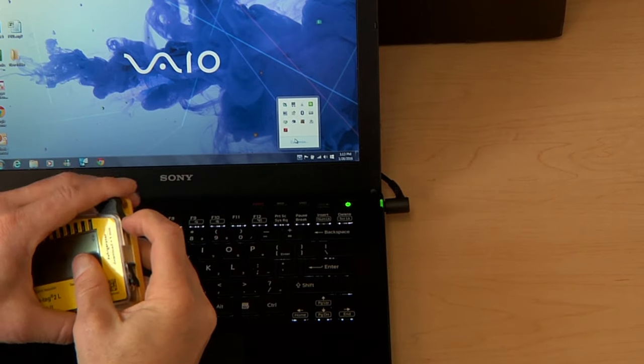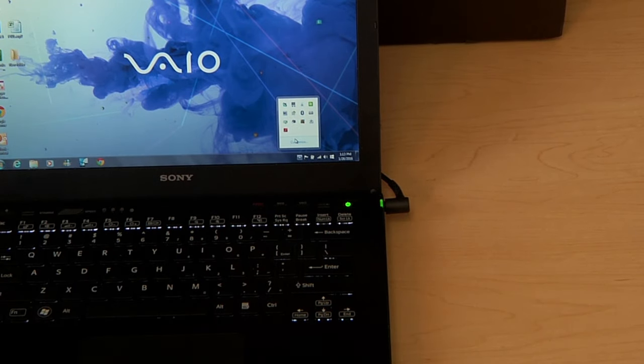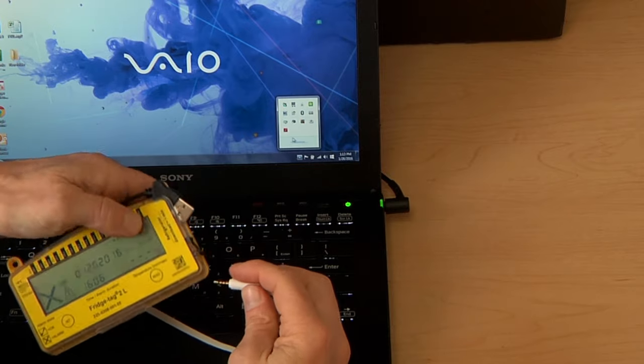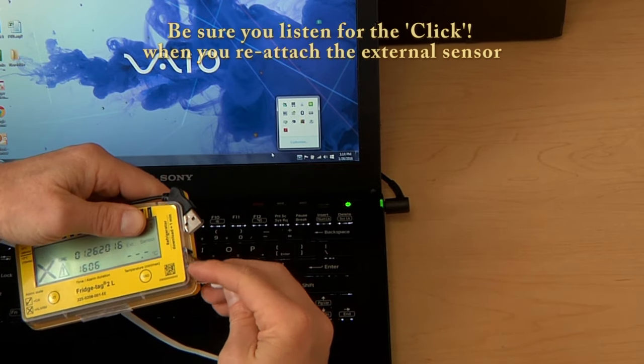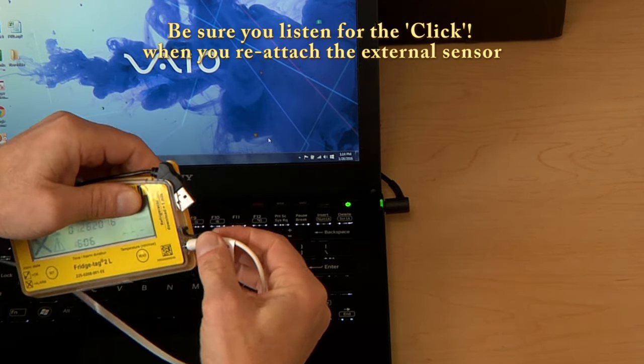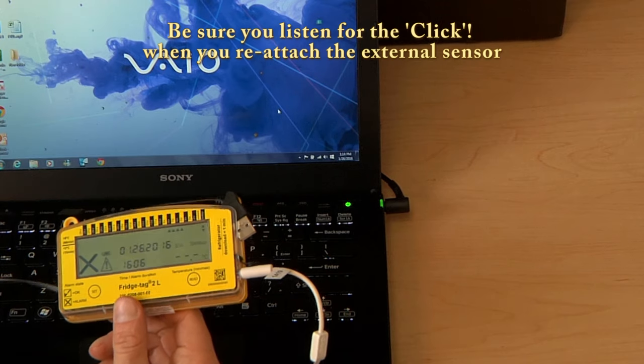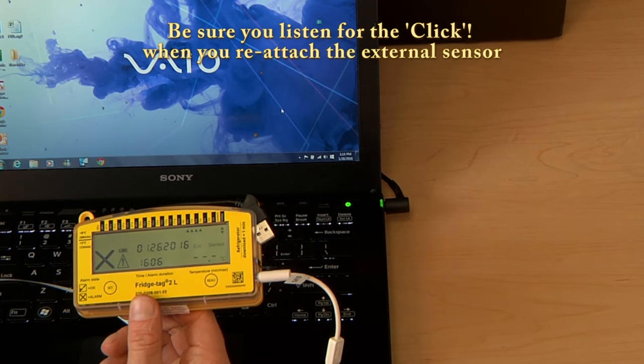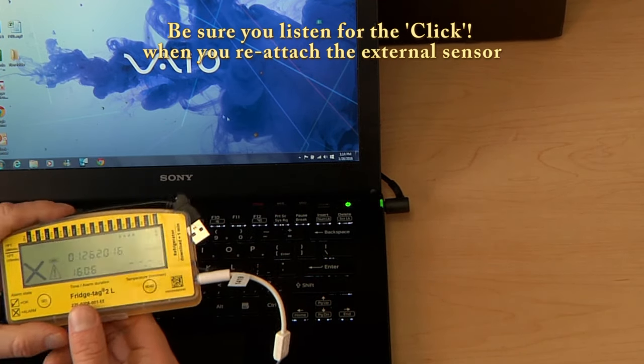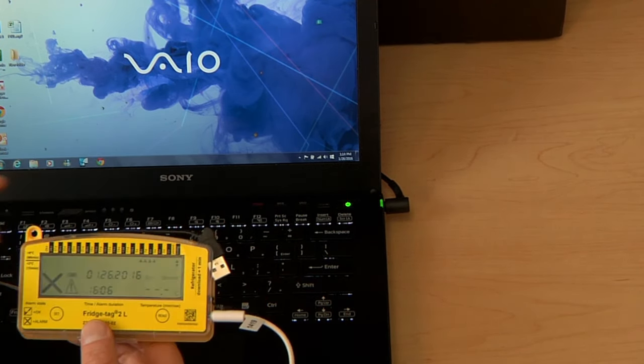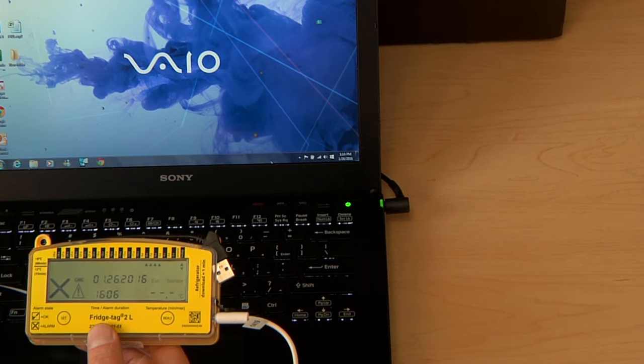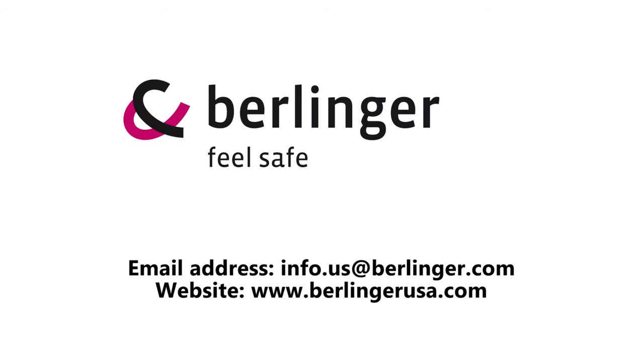And it's ready to return to your storage unit. Be certain when you do take it to the storage unit to listen for the click when you reattach the external sensor and wait a minute to view a current temperature on screen. Thank you.